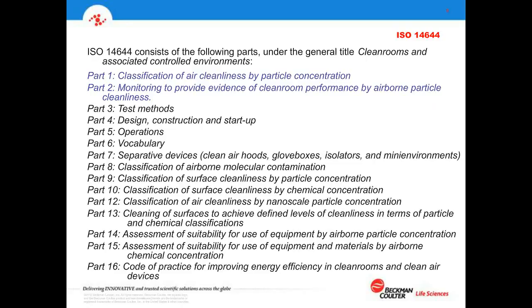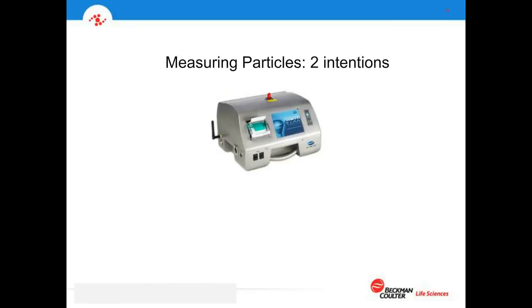As I mentioned, ISO 14644 today consists of many parts, up to 15 of them at the moment, and that speaks to cleanliness in various forms. Again, we're focused just on the first 2 sections related to particles in the air.